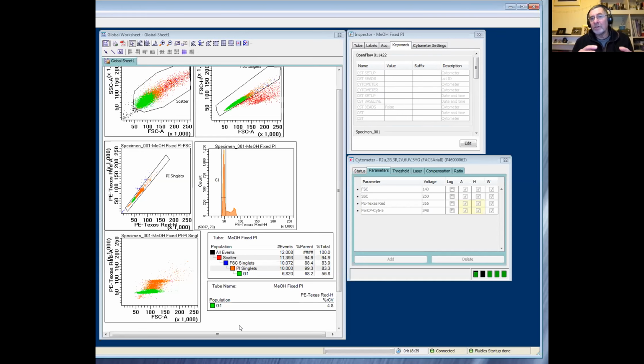So there's more variation in the conformation of the DNA in G1. I can't remember what cell line we said this one was, but I do a lot of work with Jurkats or HL60 cells. I expect that to be about 4 or 5. If I use something like HeLa cells, I'd expect it to be maybe 6 or 7, a bit broader. So it will differ between cell lines. So don't panic if your CV is different to what we show you here.